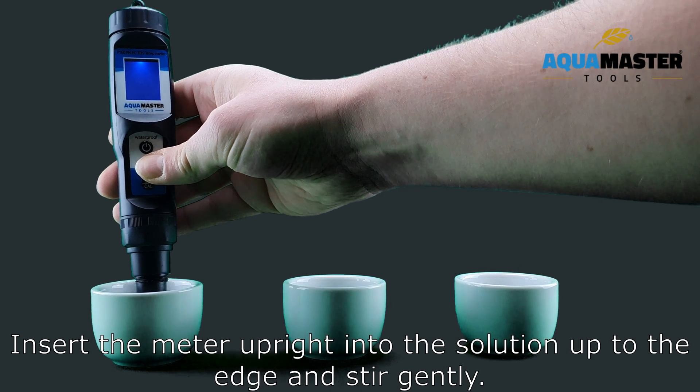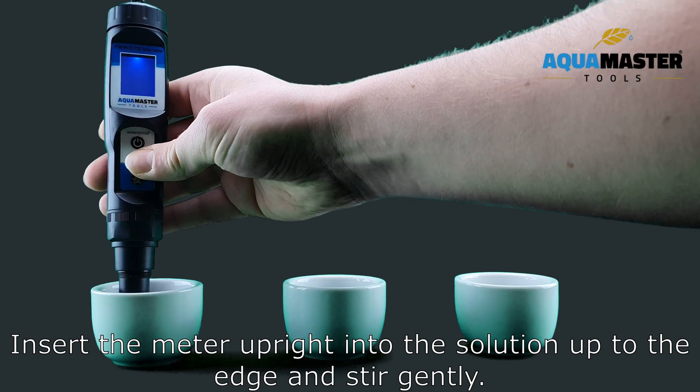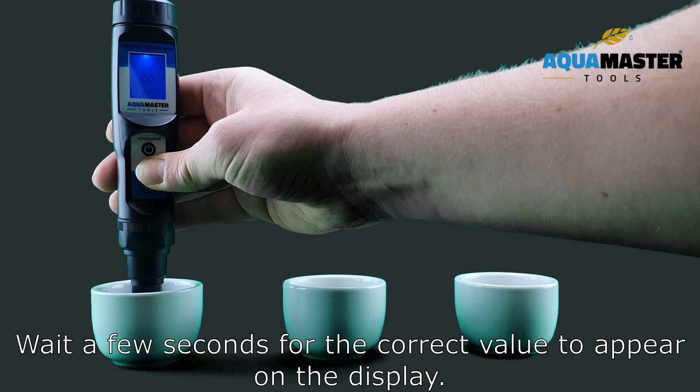Insert the meter upright into the solution up to the edge and stir gently. Wait a few seconds for the correct value to appear on the display.